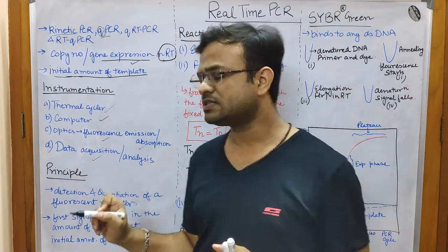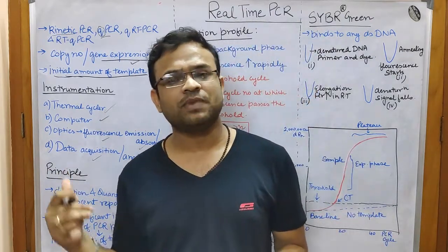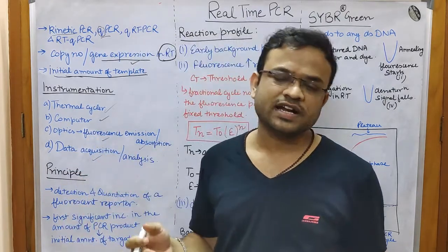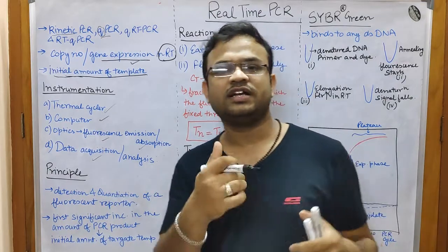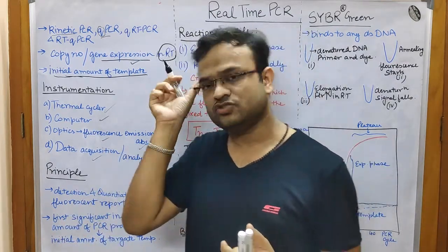So now last is data acquisition and analysis. This is actually the main part of the instrument, which handles the data acquisition. What does data acquisition mean? To take the data from the thermal cycler, and analysis of the data that has been obtained. So this was the last component of the instrumentation.